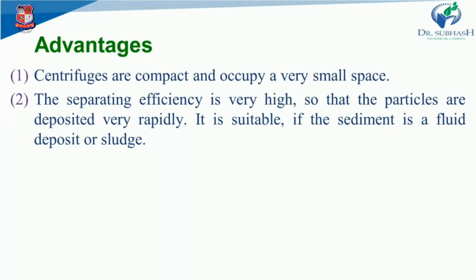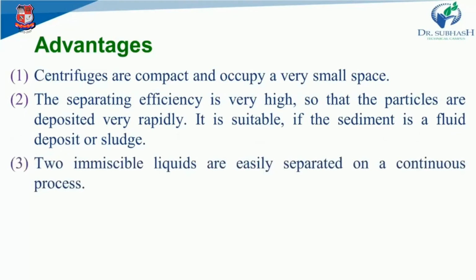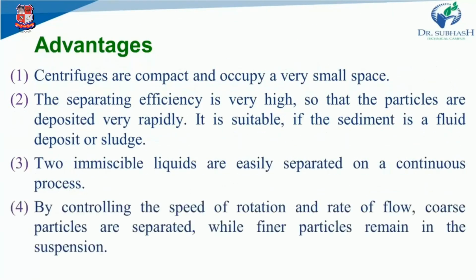The separating efficiency in this case, you can really connect it because ultracentrifugation is really important in separating very minute, even minute size of globule size or particle size. Then ultracentrifugation will be really helpful in separation. Two immiscible liquids are easily separated in a continuous process.